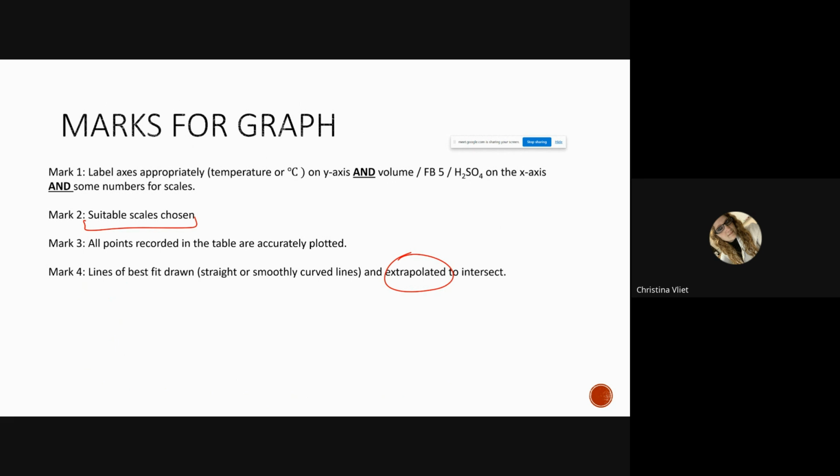So you need to measure the temperature to the nearest 0.5 degrees. Each of these little lines is a degree. It's either right on the line or you estimate that it's in between. If it's in between the lines, you do 0.5. And if it's right on the line, you do 0.0. So what do you think this is? Just by looking at it. Just listen to me, I'll guide you. I'll give a little bit of background about the thing. You've got to figure that out. So you want to go 10.5? No, I don't think it's 0.5. Good?